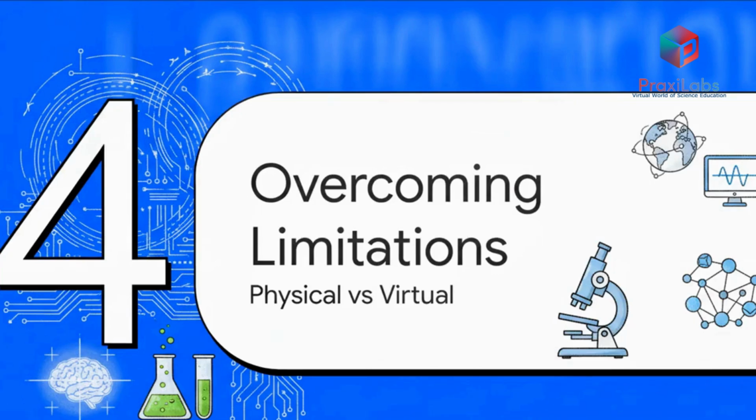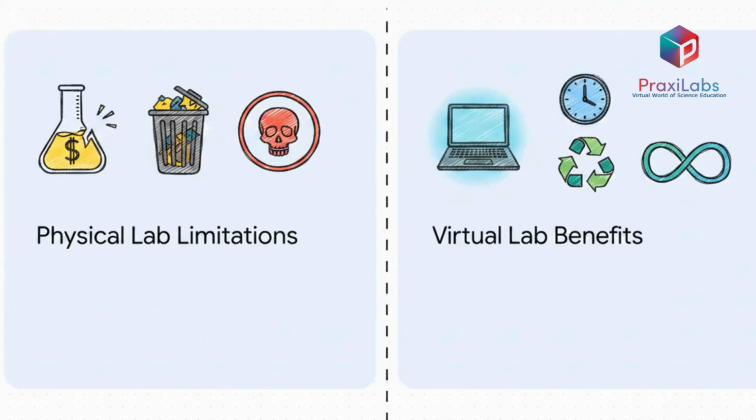Which brings us to Section 4, overcoming limitations, physical versus virtual. Physical labs are completely plagued by high costs for chemicals and equipment, massive material waste, and very limited access, because obviously you can't just leave a toxic lab unmonitored.